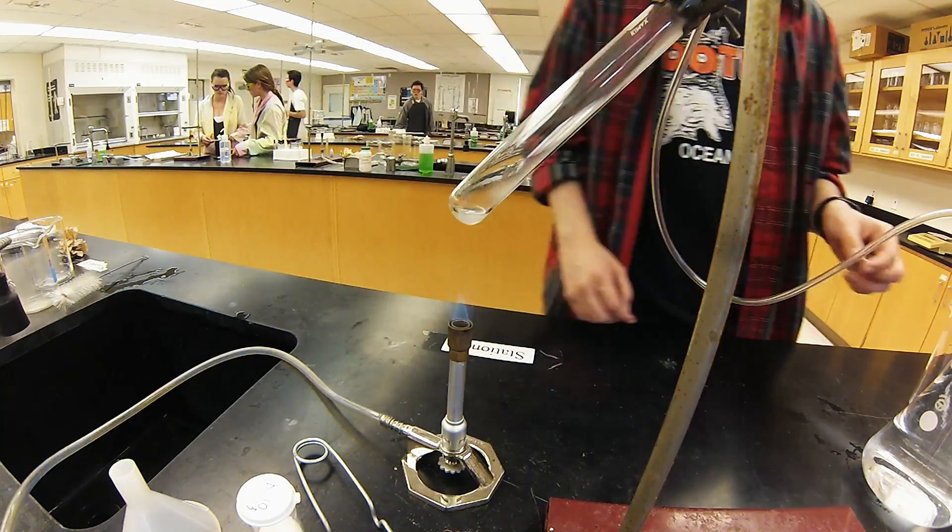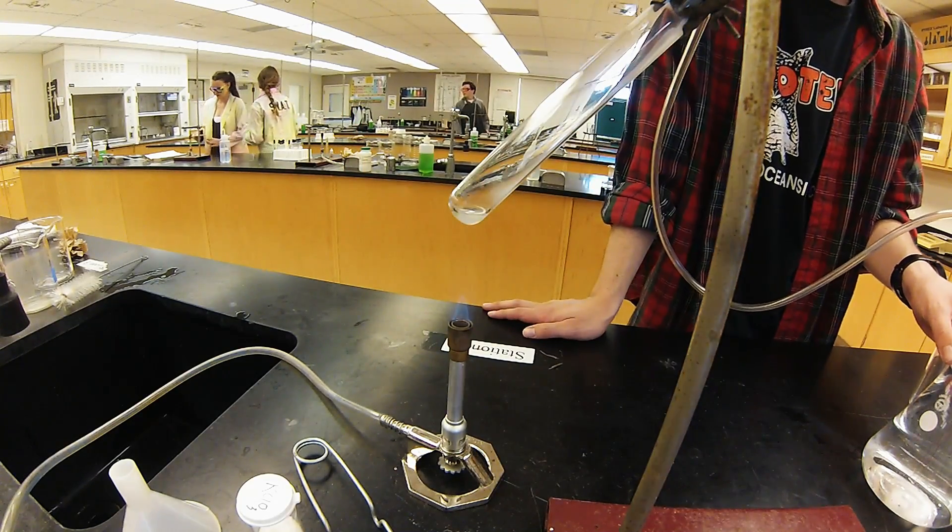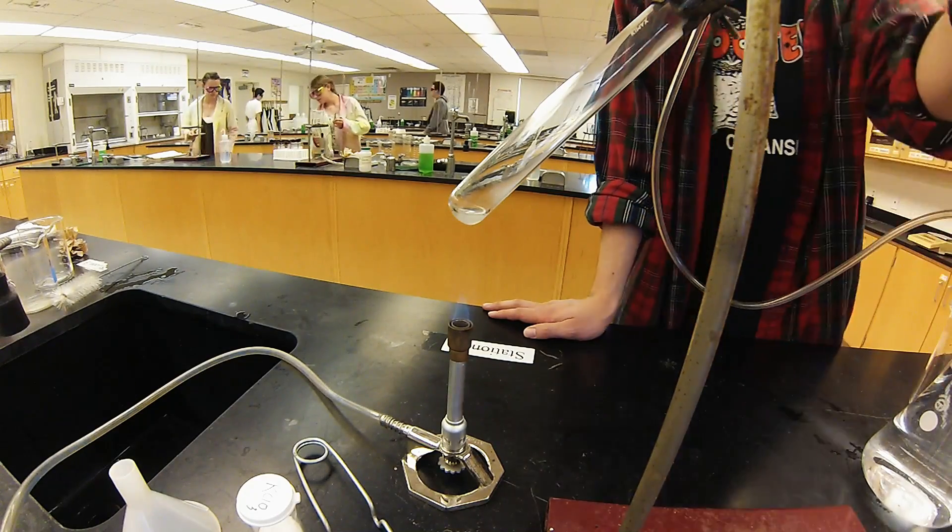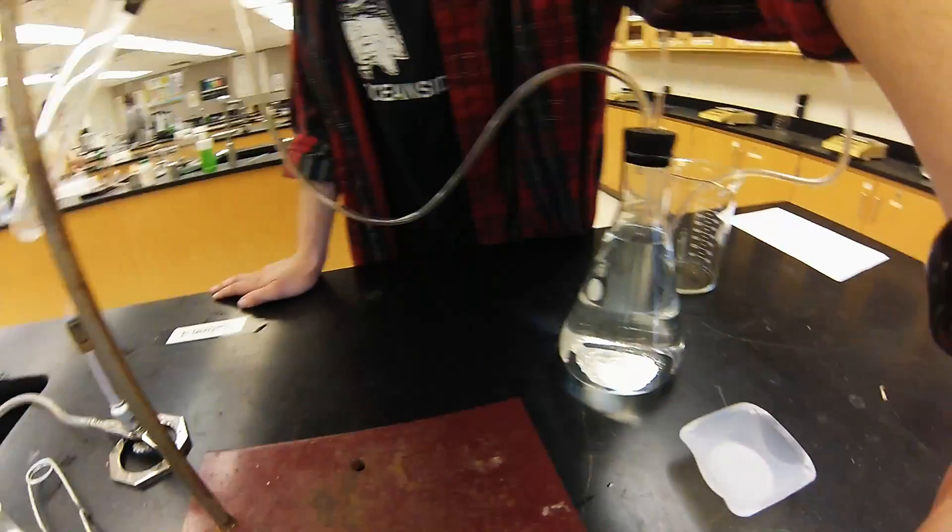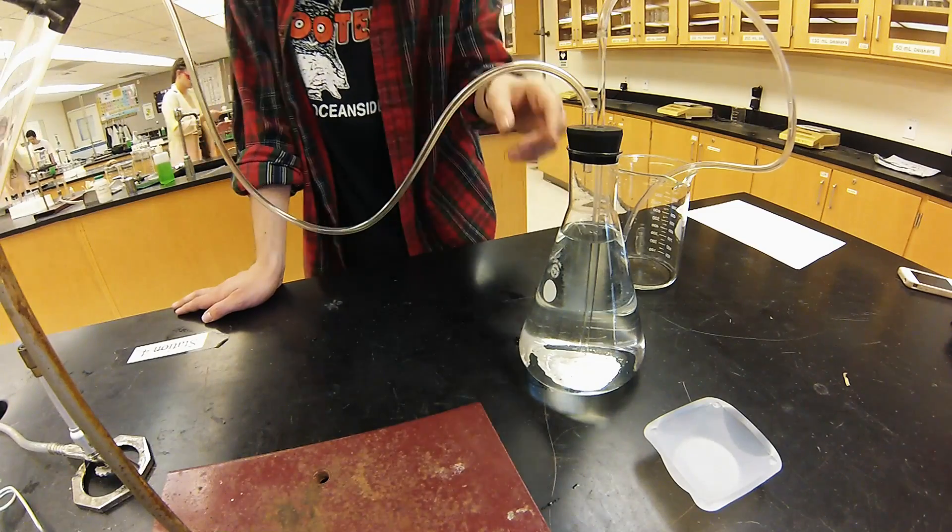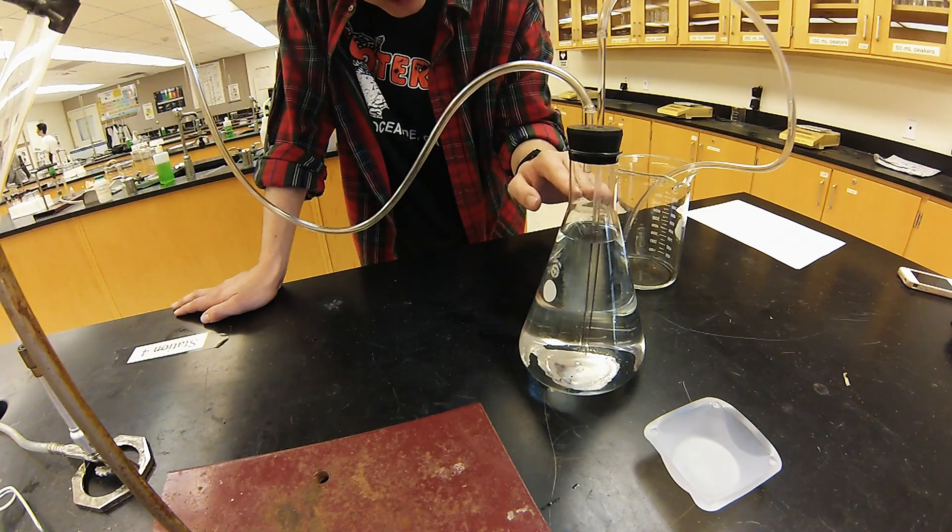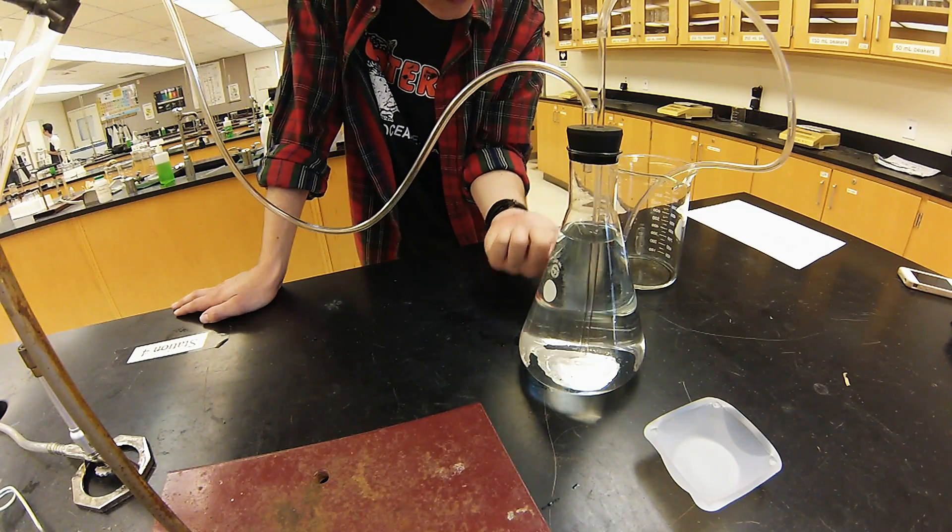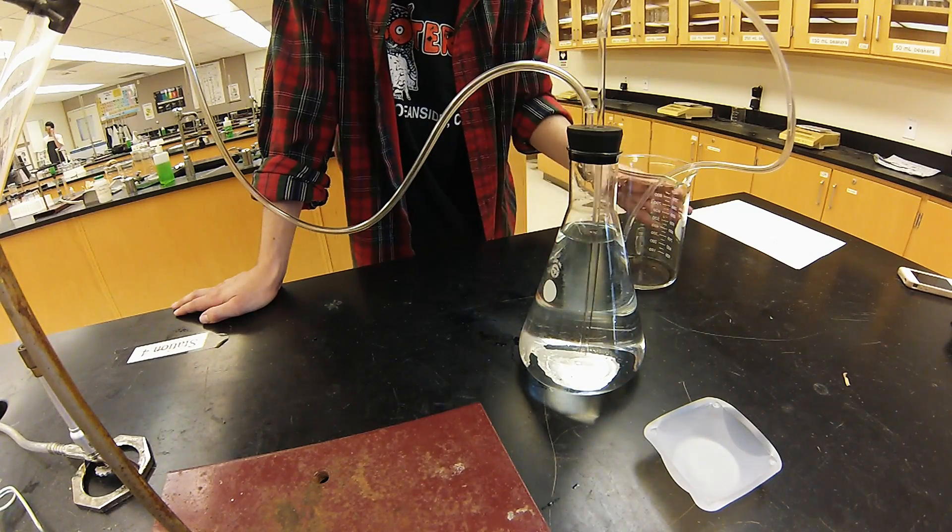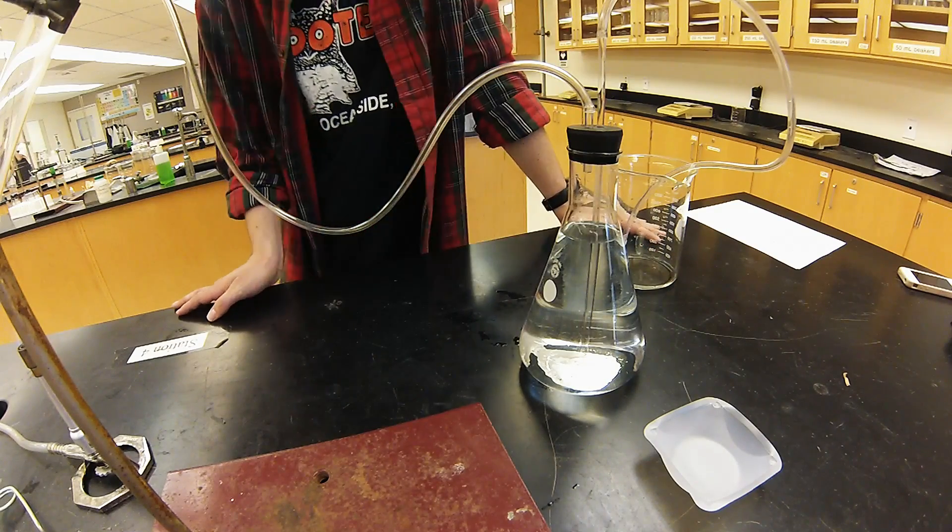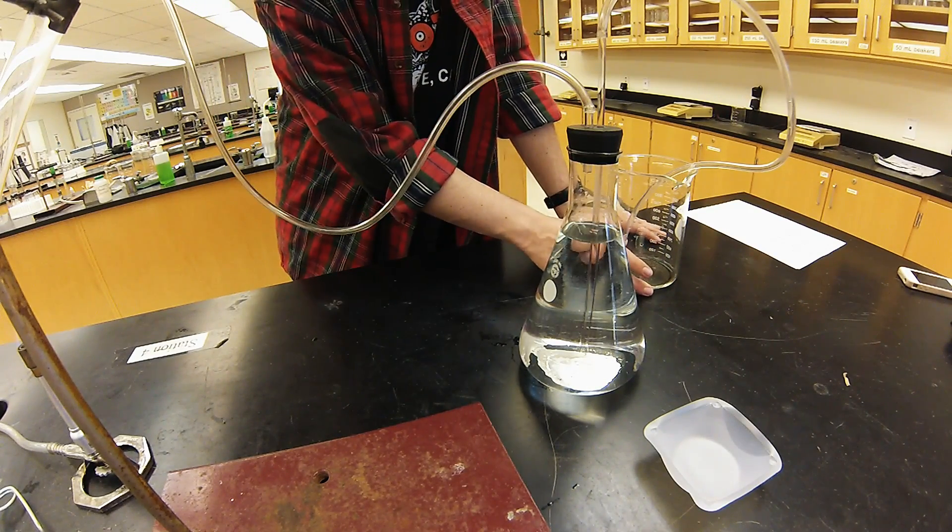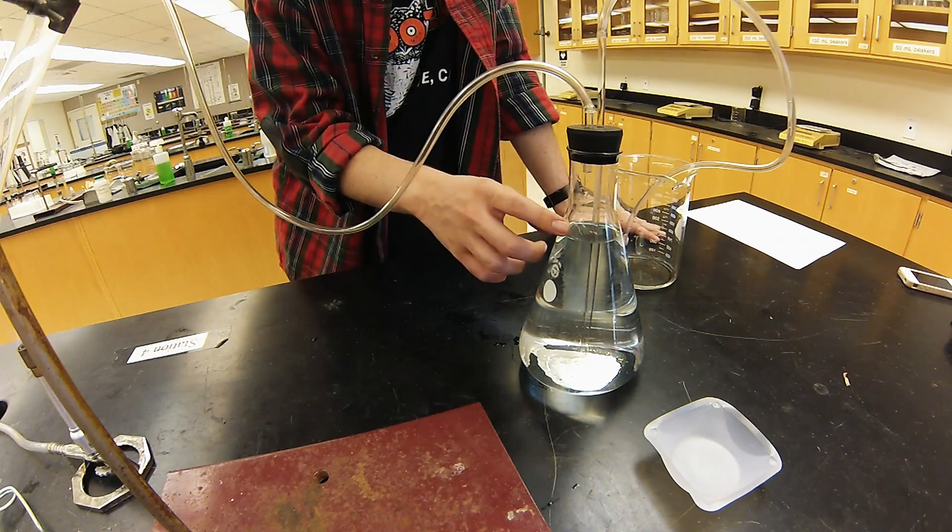And so when the Erlenmeyer flask has more gas being pushed in, it in return displaces water and pushes it into our large beaker. And there we will be able to measure the volume of water displaced by oxygen.